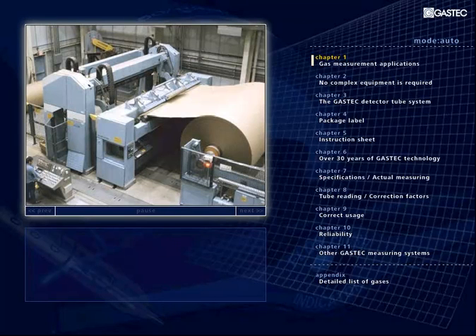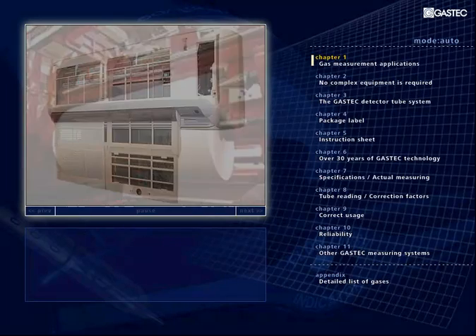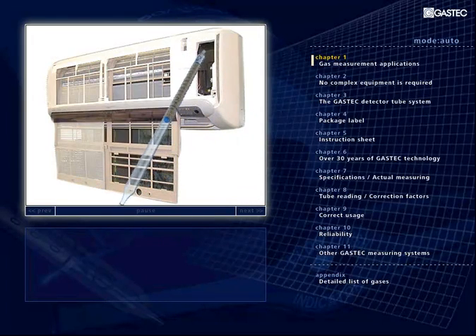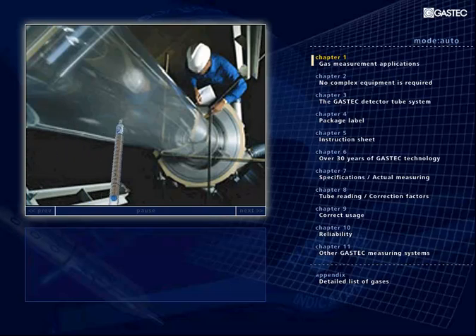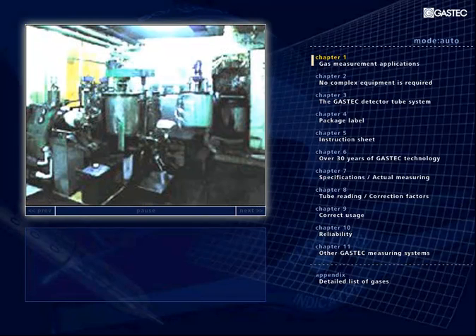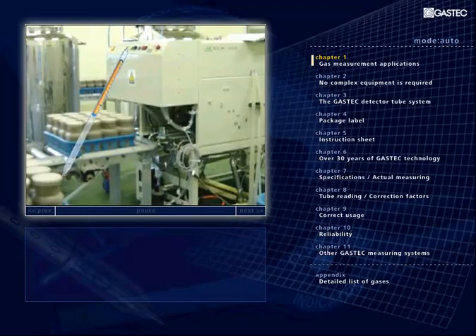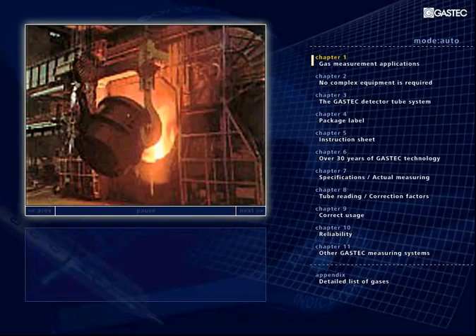For example, are the raw materials in the right compositions or proportions? Do filters, air cleaners, fans or the like function properly? What about material flowing through a factory pipeline? Are the concentrations of the target medium correct? Are there undesired or harmful substances present? Is there leakage? Are chimneys or exhaust flues emitting any toxic fumes or gases? In what concentration? Within permissible limits or not?